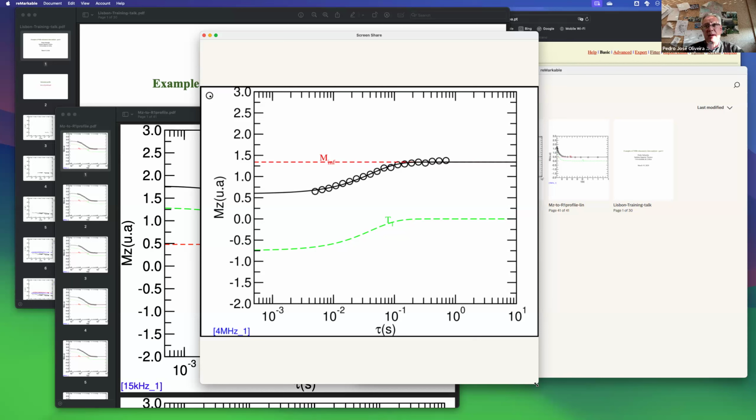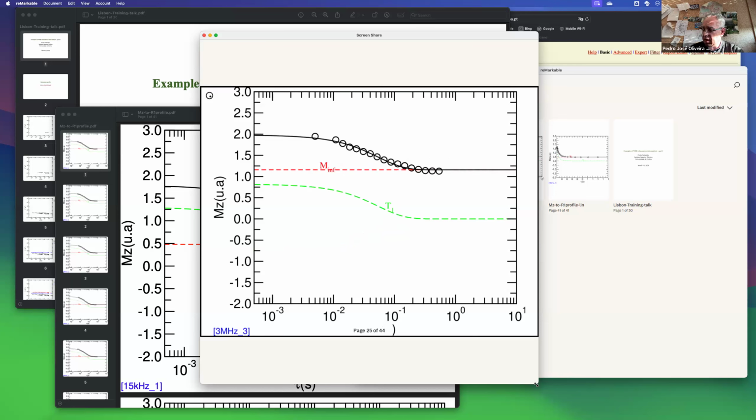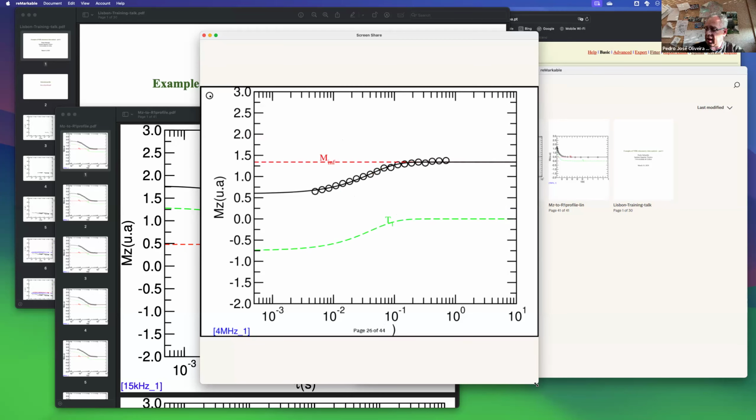So when it comes to this concept of inversion recovery, or let's say recovery, what it means is that instead of starting from a decay of the magnetization that comes from an initial value, M0, at a high value, and then we see the evolution to a low value, so we have a decay, instead of that, we have a recovery. So it means that we start from a magnetization that has a lower value, and we observe how the magnetization evolves until it recovers to, let's say, the initial value, which is higher.